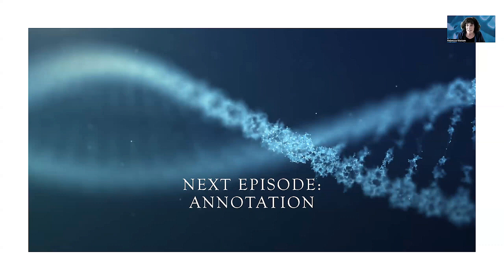And so next time, we're going to step through annotation. And I want to point out, so far it's pretty easy. You haven't had to code a single thing, and that's going to continue.